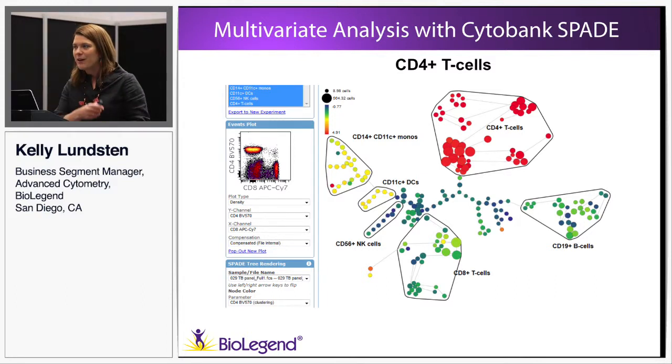And then I was talking to my friend who is working at Cytobank, and he's like, well, obviously you can use either nearest neighbor or principal component analysis type software that we've all heard about, right? We hear about it at users group meetings all the time. But since I had an expert at my disposal who could help me walk through SPADE, I decided to try to apply my data to it and see if we could make it meaningful.